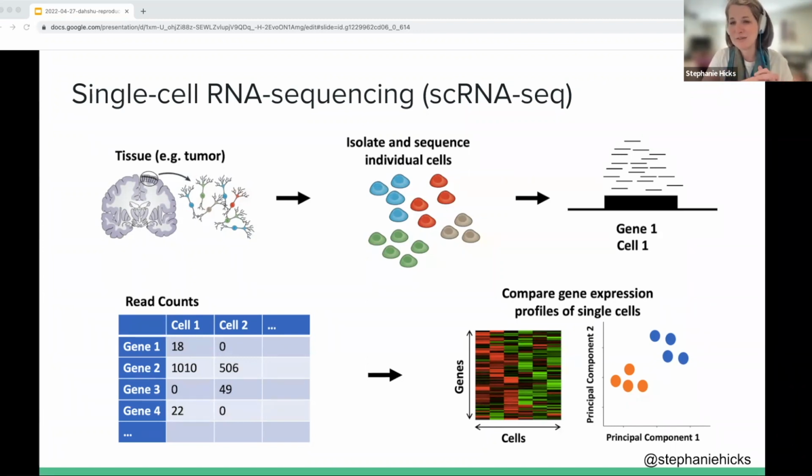It's unlikely, in fact, that a cell needs to express more than a handful of genes or a couple thousand genes at a given time for its function. So with this matrix, we can do a lot of great things. We can make heat maps and plot expression for given genes or for given cells. We can apply machine learning algorithms or dimensionality reduction techniques, such as principal components analysis, and see how the cells or the observations sit in a low dimensional space, maybe a linear space or a nonlinear space. Maybe we see the cells begin to separate and cluster in this low dimensional space.